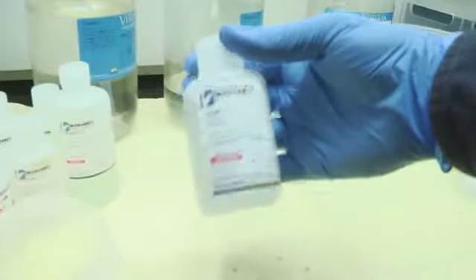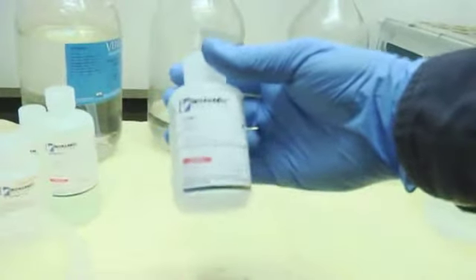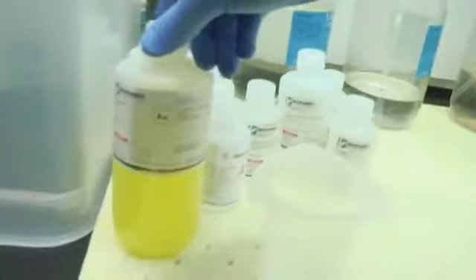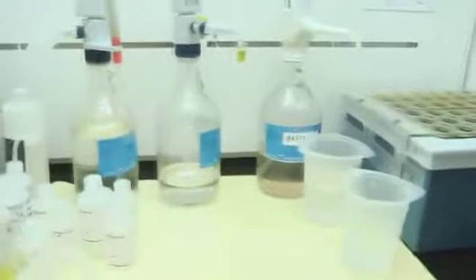And then once you have that clue, you can do a separate test for tungsten. And in order to do that, of course, you need, well, what do we have right here? Tungsten. This is a tungsten external standard from Inorganic Ventures, and this is what we use as part of the process of creating the external standard in order to test for tungsten. We've got a lot of other standards in here, of course. Here's mercury right here, a mercury standard. Here's a custom standard that we had manufactured for us, and here's some gold right here that we use to spike some of the samples in order to maintain mercury in those samples.